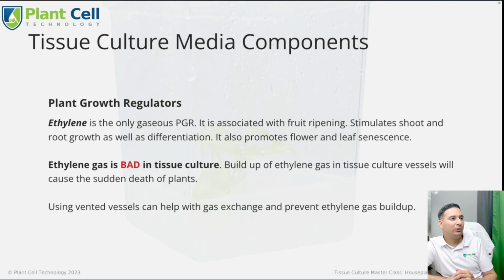Alocasia, I have also done 2 to 3 milliliters, and that has done really well, especially in the biocouplers I did a couple of videos ago. I did my alocasia blackberry variegated in one biocoupler, which a lot of people were asking me why it was all white. Well, it was so white because it was only the corms. It didn't have any leaves, but it's multiplying exponentially. I have a ton of plants in that one biocoupler. I increased the amount of cytokinin. That's why I got that result.